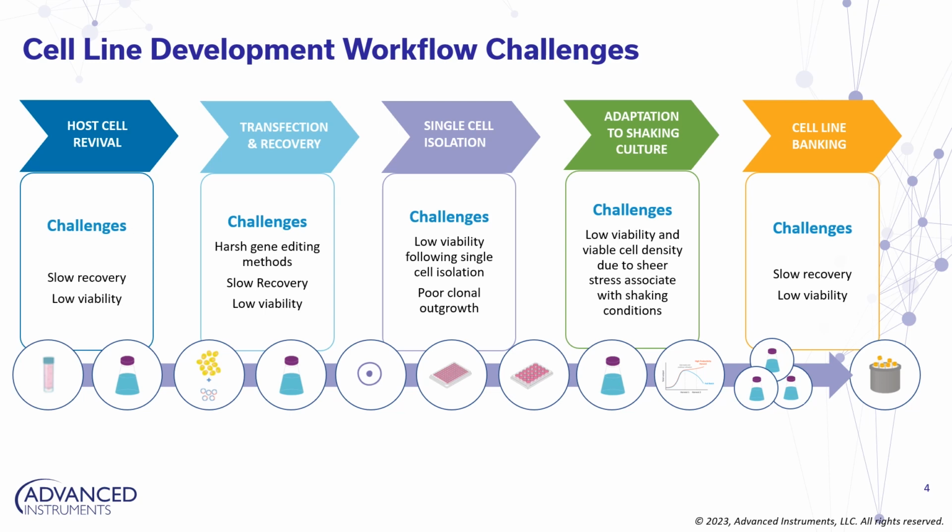Following confirmation of clonality, scientists are required to expand their clones from the cloning plate and adapt them to shaking culture conditions. Shear stress associated with shaking conditions poses yet another challenge to the cell line development process and often results in scientists losing a handful of clones. Finally, when it comes to banking of the top clones, again, the harsh conditions which accompany cryopreservation cause for concern, threatening both viability and viable cell density of the cells.